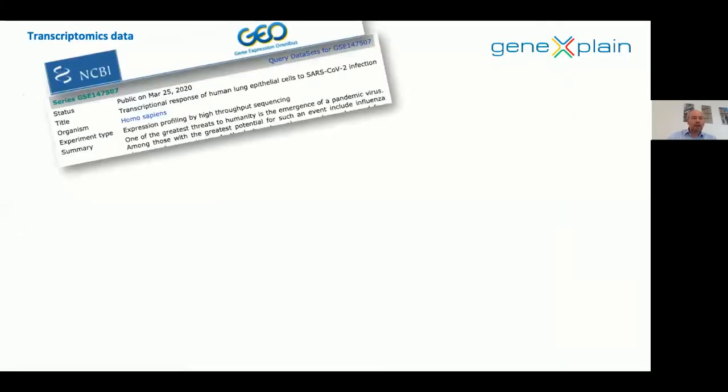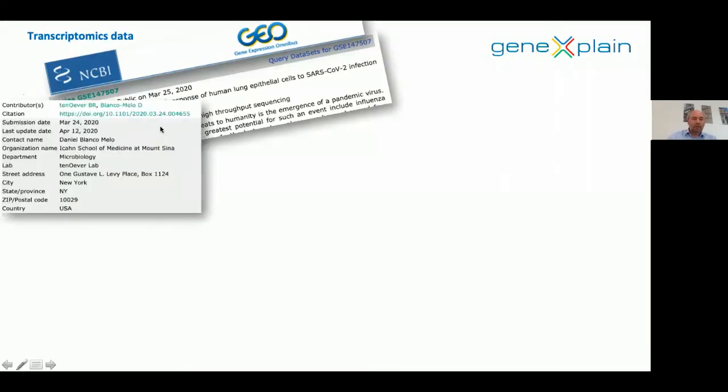So in this first paper, which was done by the group from the US, there was one patient, and they took samples from the lung of that patient. I think it's post-mortem samples. And as a control, they got samples from a healthy post-mortem patient. So not healthy in the sense of not infected by COVID-19. So the control was also RNA-seq from another patient sample from lung.